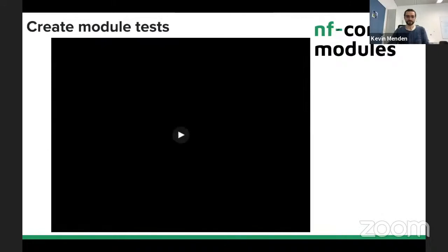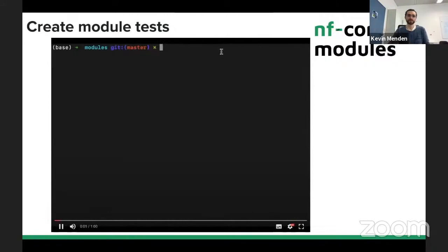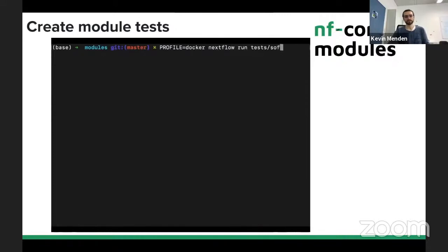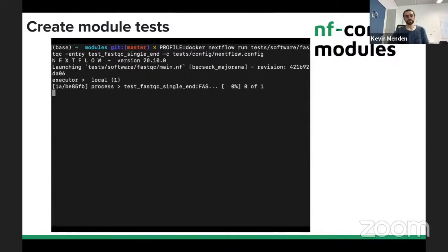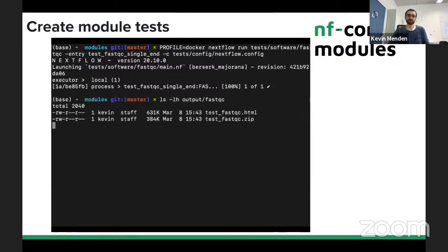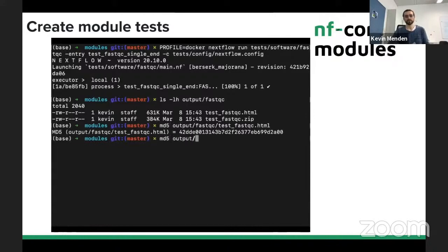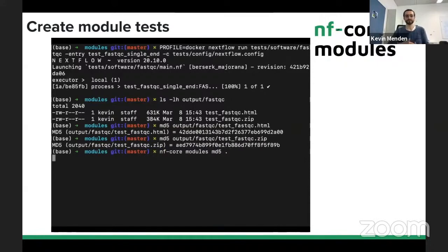Here we'll try to run a module. You first define a profile - in this case we use Docker. Then, as usual, use Nextflow run pointed to your module code and use an entry. We use the test_fastqc_single_end entry, which is the workflow we defined earlier. You always use the test config Nextflow configuration file. This will create the output directory with the outputs of this particular module. Then you can type md5 and generate md5 sums for those outputs, and put those md5 sums into the test.yaml file. Tools available soon will make it easier to create those md5 sums, which is particularly nice if you have not two output files but maybe 20.